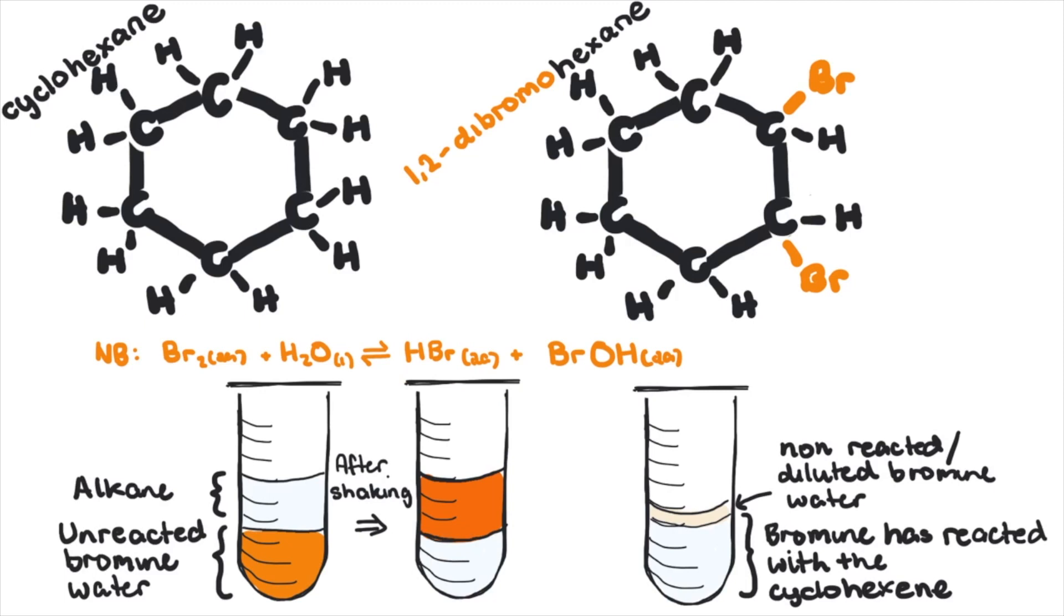This is because the bromine as a molecule is non-polar and should more readily dissolve in a non-polar substance. This being your cyclohexane top layer, not your lower water polar layer.